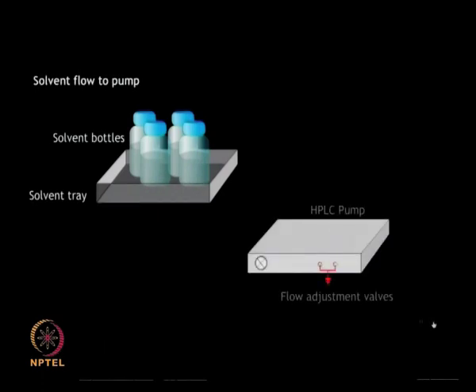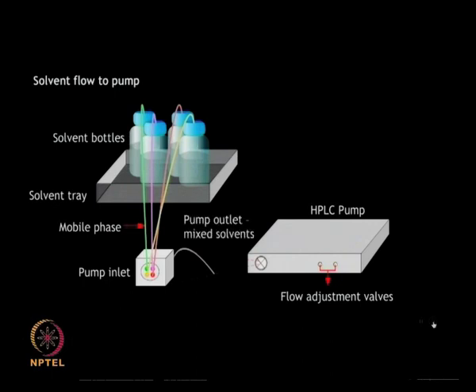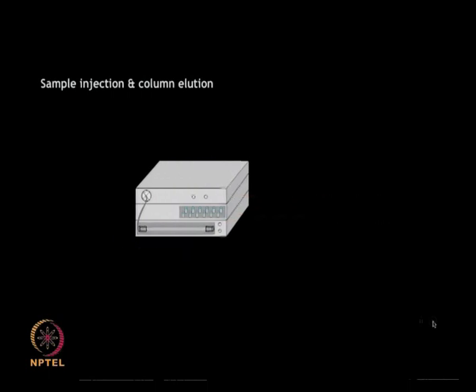Here you can see the various components which are involved in performing the liquid chromatography. Different solvents can be placed in the solvent bottles depending upon the purification requirements. These solvents are mixed in the desired ratio and pumped into the column during elution after removal of any trapped air inside by means of the degasifier.